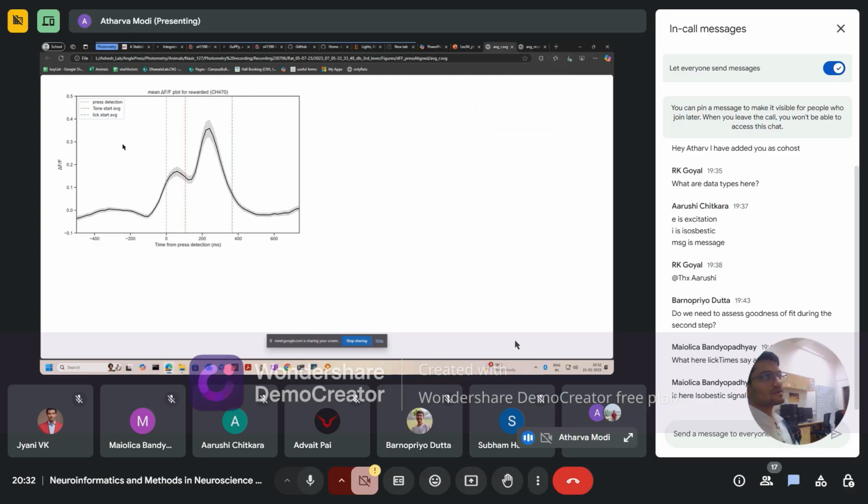So these kinds of analysis will yield interesting insights on how neurotransmitters behave in behavior, especially research on neuromodulators like dopamine or norepinephrine. These are quite frequently studied using fiber photometry, and very good new sensors have been developed for studying these neurotransmitters. There is bundle fiber photometry also, which I may introduce later, using which you can study cellular level details.